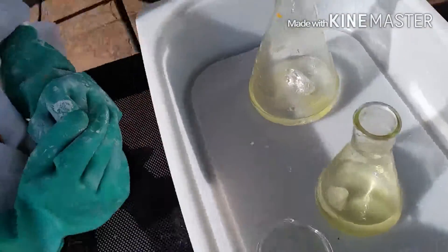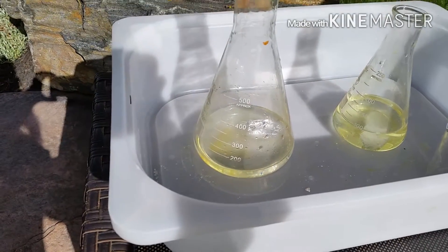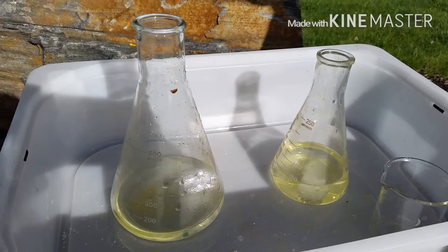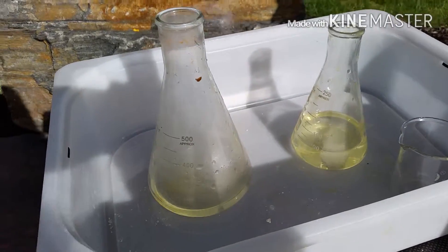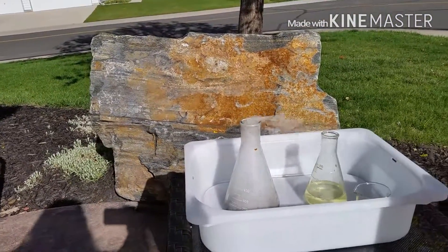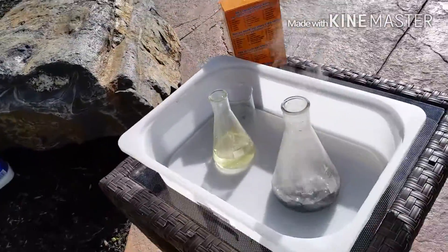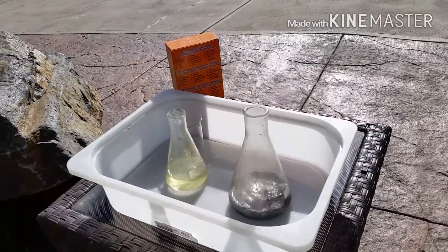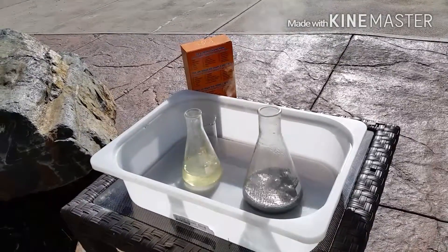This is the happiest part of the experiment. This one's bubbling really violently, and so is the other — it's about dissolved through the layer of aluminum oxide. You can see that this one started smoking now and is releasing probably hydrogen gas. Don't breathe in the smoke because it has chlorine in it and hydrogen and it's hot.